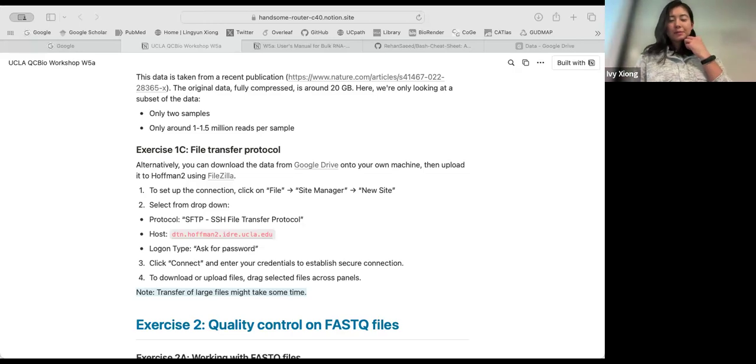Well, I see the KD1 underscore FastQC zip. Yeah, that's the output. And then the HTML file contains all the quality assessment of the file, but we have to download it so we can see it on the browser.